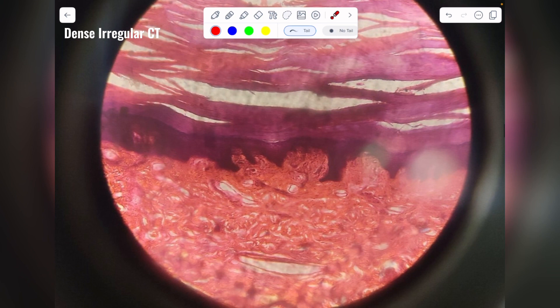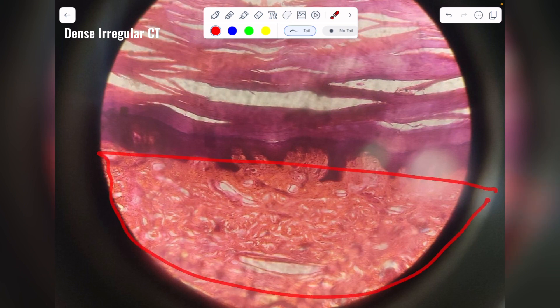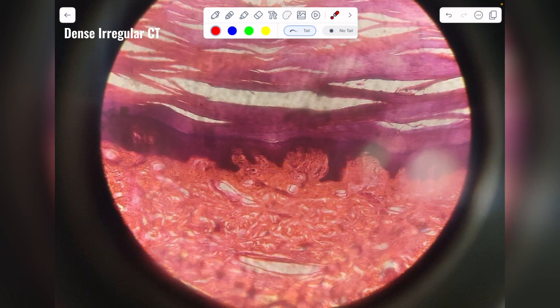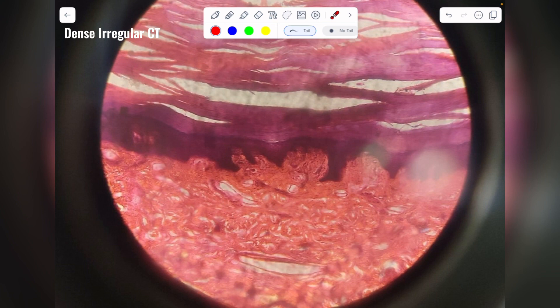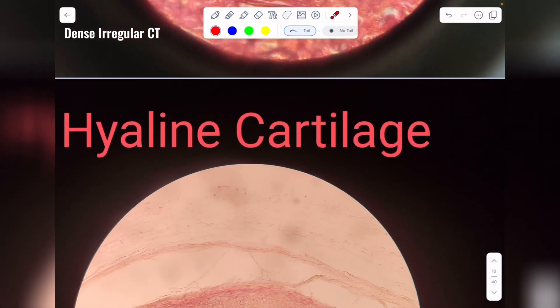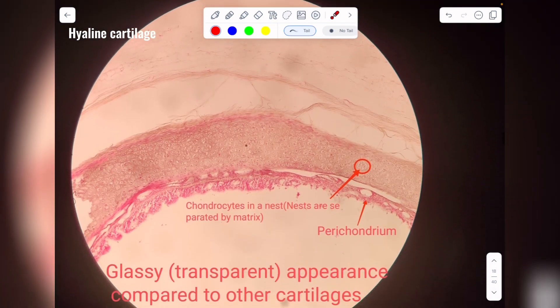Here is dense irregular connective tissue — this is the dermis of the skin, which contains fibers. If you look at the arrangement of the fibers it is highly irregular: some fibers are arranged in one direction, some in another. Now let's look at specialized connective tissue.